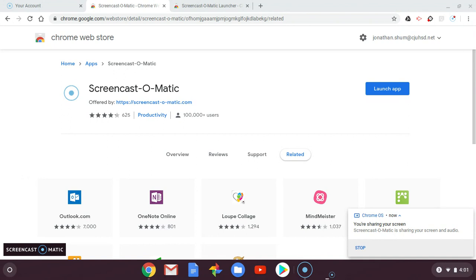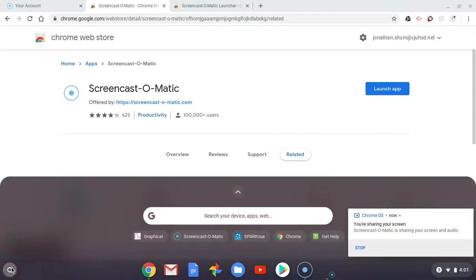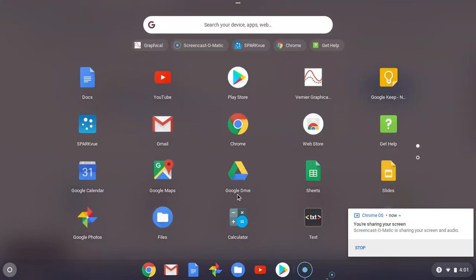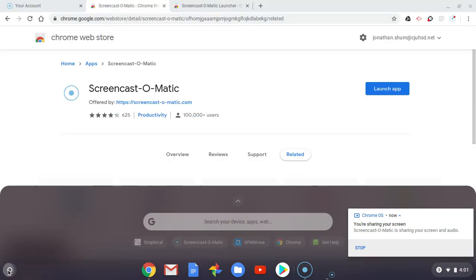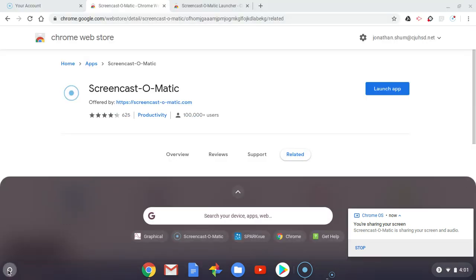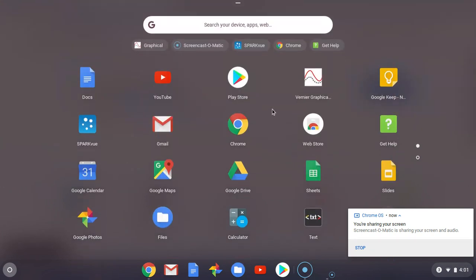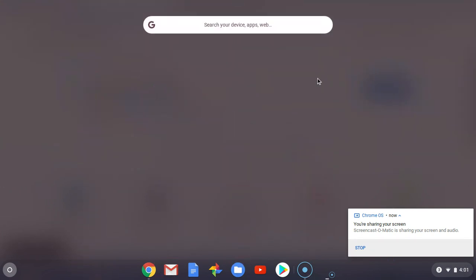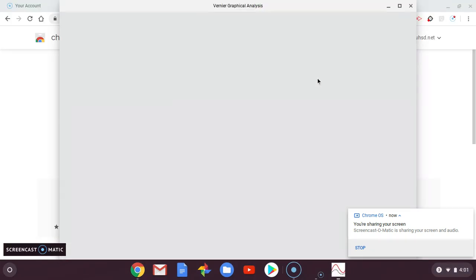You're going to have to open up this app called Graphical Analysis, so Vernier Graphical Analysis. What I did is I went on to this circle button, pressed show more, and then I'm going to open up this Graphical Analysis app.